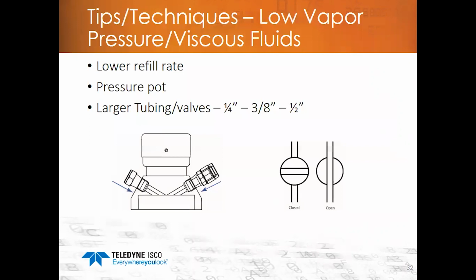The lower drawing on the left shows a larger port system. You can notice the ports are straight. There's no angle as is in our standard cylinder caps. That further reduces restriction to flow.